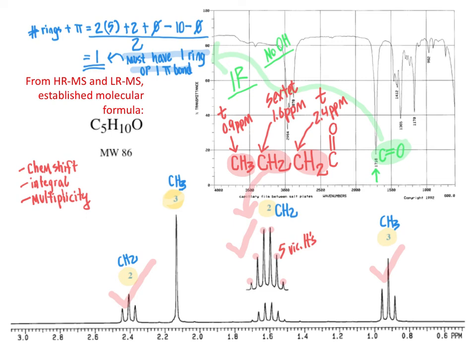We need to complete the end of this molecule by using all of the NMR data that we have available and making sure that we've accounted for all of the atoms in the molecular formula. And in order to do that, we have one signal left here. It is a 3 hydrogen singlet. And where can we plug that in? Well, we can plug it in right here, adjacent to the carbonyl on the other side. I'm now highlighting that methyl group that we just plugged in. That is our methyl group that was a singlet, which I'm going to abbreviate as S, at approximately 2.1 ppm.